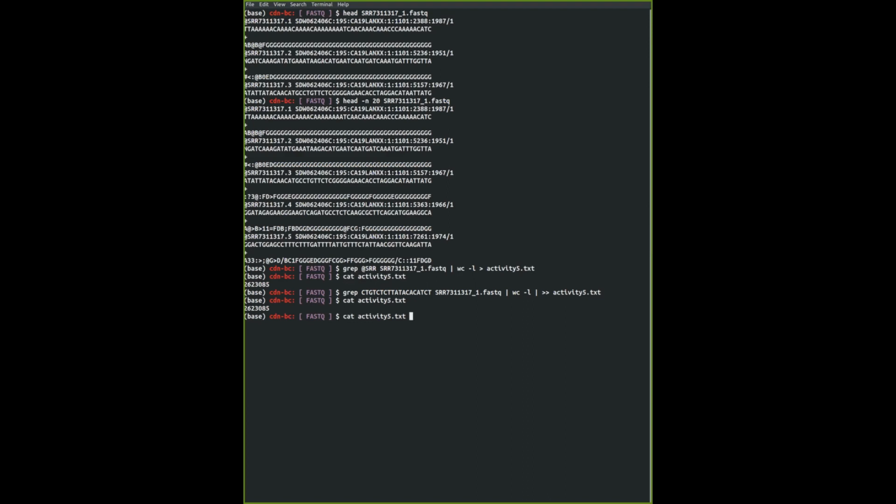Well, it's a good thing if there's nothing, but there should be something. There was a couple of sequences with this Illumina sequence. Let me see. No, sorry, I missed out. I have made a typo. See, this always happens when you don't pay attention.